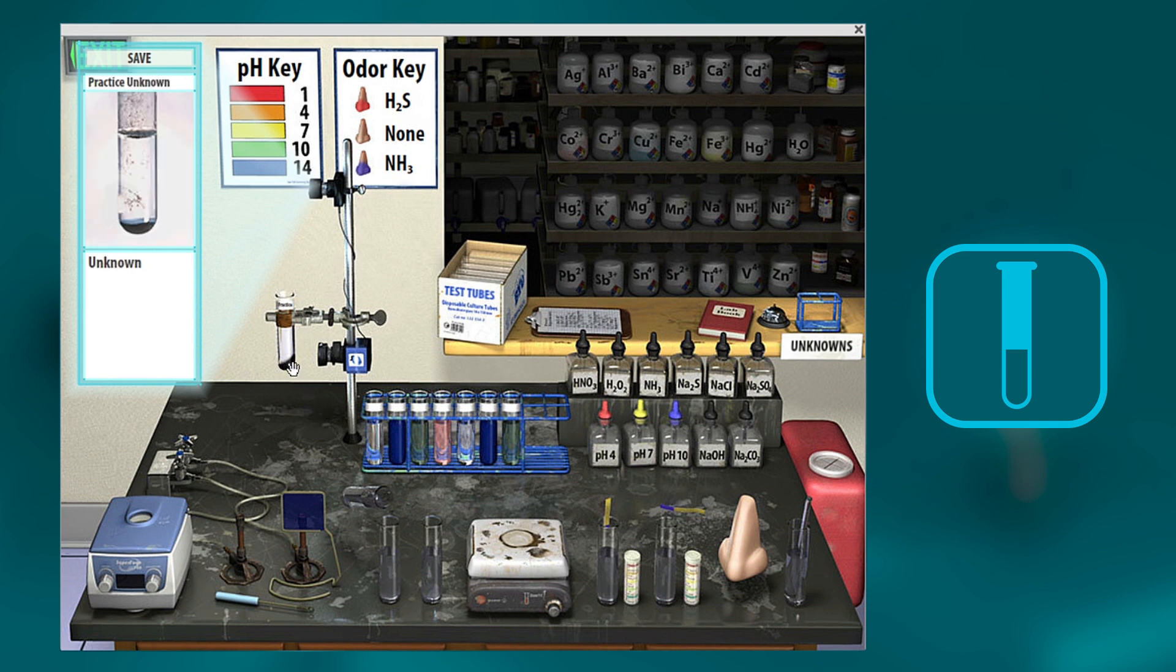Interesting. So I ended up with this solid again. What was that? Oh yeah, I think I've got that. I remember what that test tells me. That was the cobalt test. And then this color, that color tells me directly what it is.